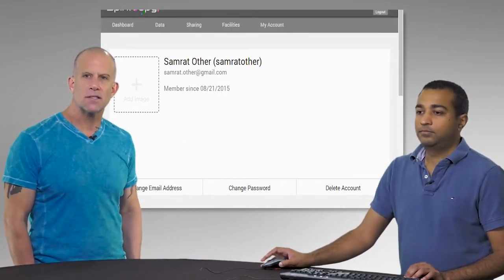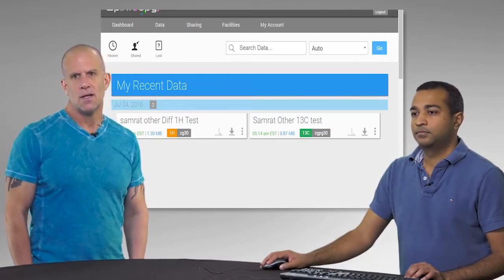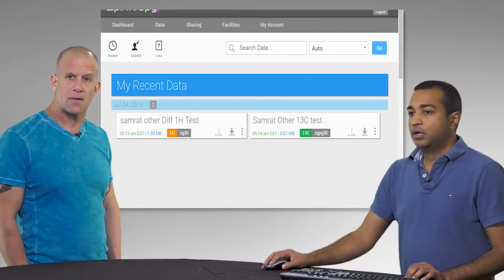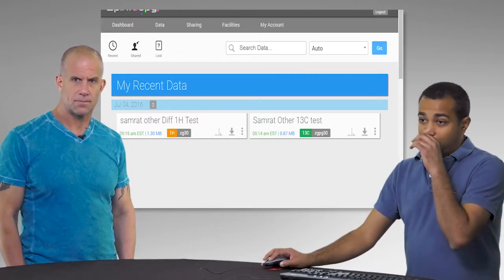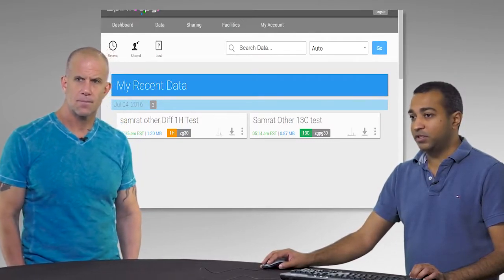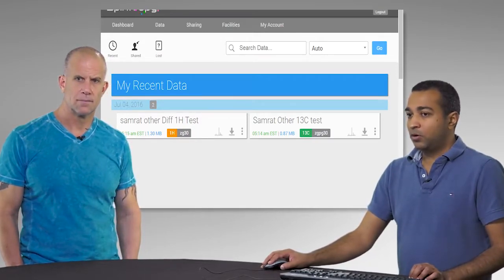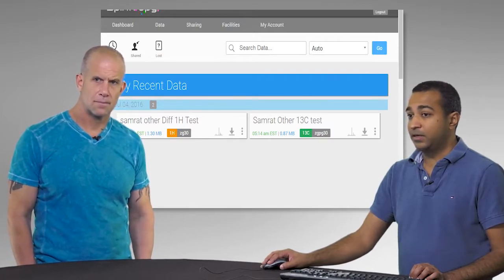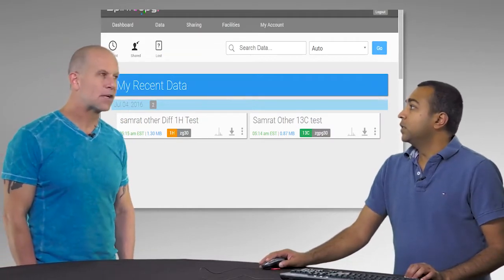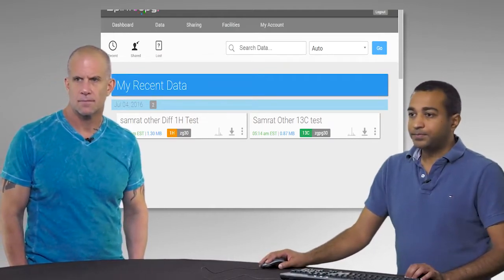Okay, so let's go to data, right? Mm-hmm. And this allows you, if it's 1D data, to both view the data as well as download it? Yeah. Both of these are 1D experiments. One's a proton, one's a carbon, and Spintropy differentiates that with these little buttons down here. It shows you what nucleus was run and what type of experiment, and the ZG30 is a common experiment on that Bruker. ZG, 30-degree tip angle? 30 degree. And this is the carbon version of that.